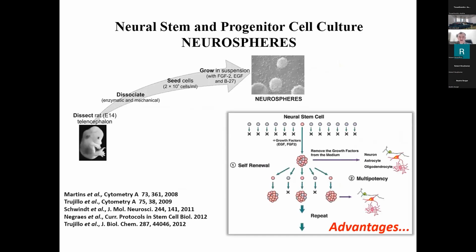So now I come to a real research project that we did in my lab. What my lab has found is that neuronal differentiation is promoted by bradykinin. Bradykinin is a vasoactive peptide, and before, nobody had shown that it may affect differentiation of neural stem cells. The idea was, again, using the same model that I've shown you before. This is an excellent model to be analyzed by using the tissue-fax system.